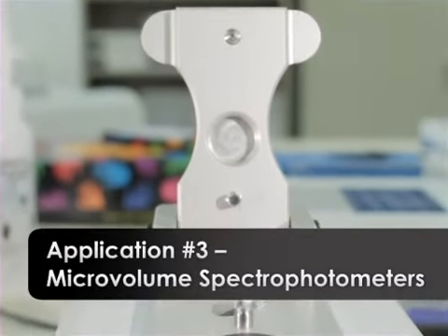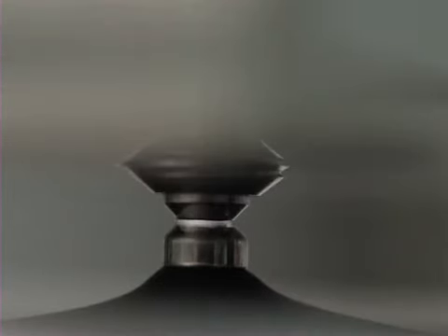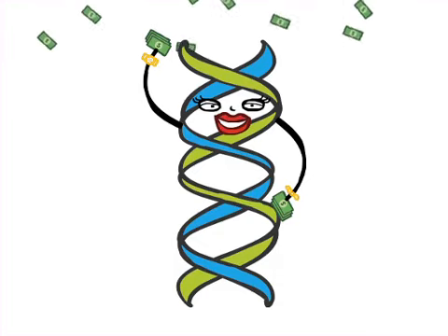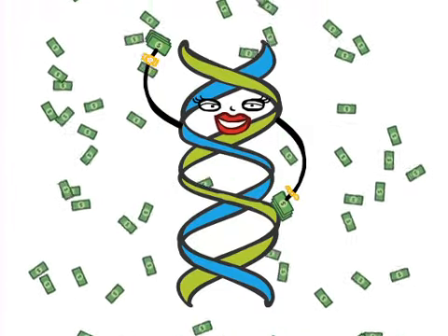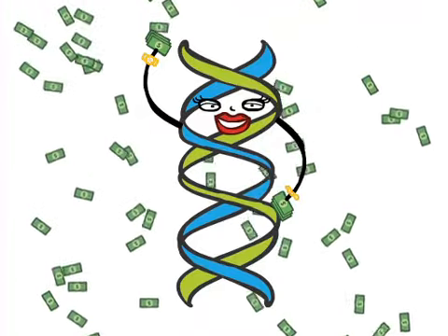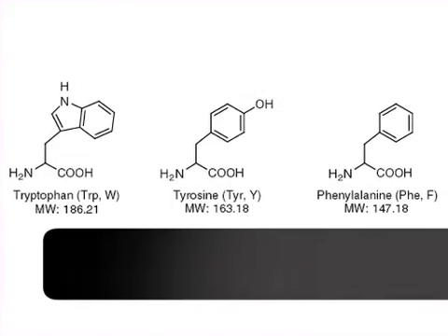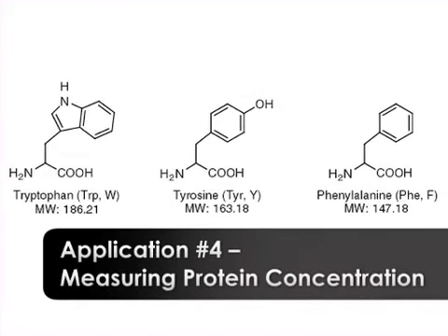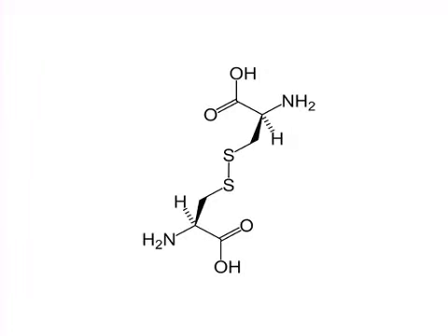Recently, the introduction of microvolume spectrophotometers has eliminated the necessity for sample holders. Such spectrophotometers use surface tension to hold the sample. Microvolume spectrophotometers are optimal for measuring quality and concentration of expensive samples of limited volume, such as biomolecules, including protein and nucleic acids. The absorbance of a protein at 280 nanometers depends on the content of aromatic side chains found in tryptophan, tyrosine, and phenylalanine, as well as the existence of cysteine-cysteine disulfide bonds.